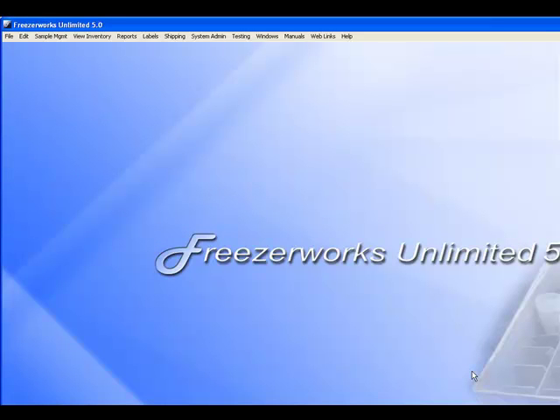Hi, this is Rick Michaels, and what I'm going to do is demonstrate to you how you can take a rack of tubes and import it 3 times so that each time you import a certain number of tubes into that rack. So it's 3 different imports, the first 30, second 30, and the last 36 tubes or so. Let me show you how you can do that in Freezerworks.